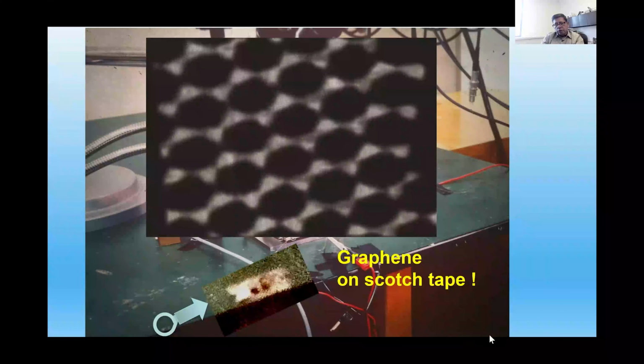But now, as the technology advances, AFM is no longer just a surface measurement tool or just doing surface topography or reference measurements. AFM advancement went deep into functional imaging, where you can correlate topographical variations. You get topography images, but you can also get different functional images: electrical properties, magnetic properties, optical properties, photothermal properties. Now you can also do nano IR, basically chemical properties. So there's a great advancement in these techniques as well as the resolution. This allows people to do multiple options on the same tool.